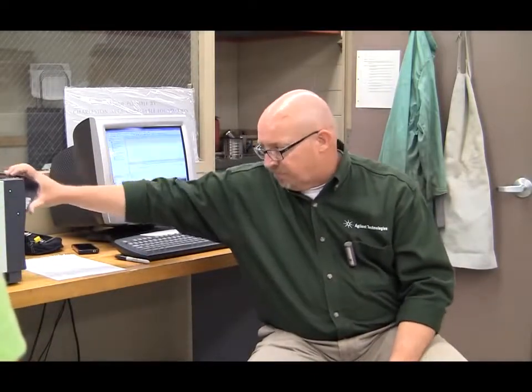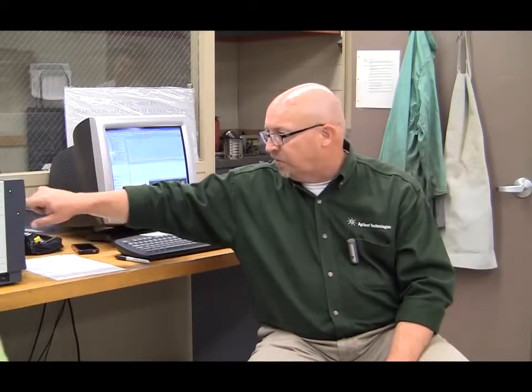So now, if you get one from us set up to do injections like we're talking about, it has an injector here. It has two capillaries, or a capillary that comes from this, goes up into a valve. On the back side of that valve is a 7.5 psi pressure relief valve, so that if you do put too much pressure, it pushes it out the back. So you keep a little bit of pressure on it, and then it has two tiny capillaries that come down here and then through the injectors.